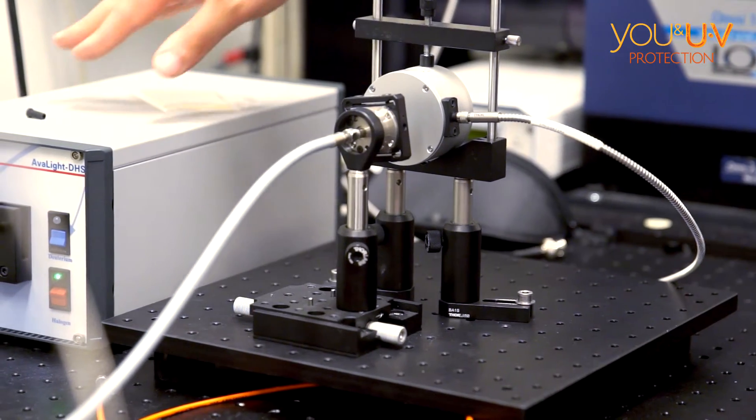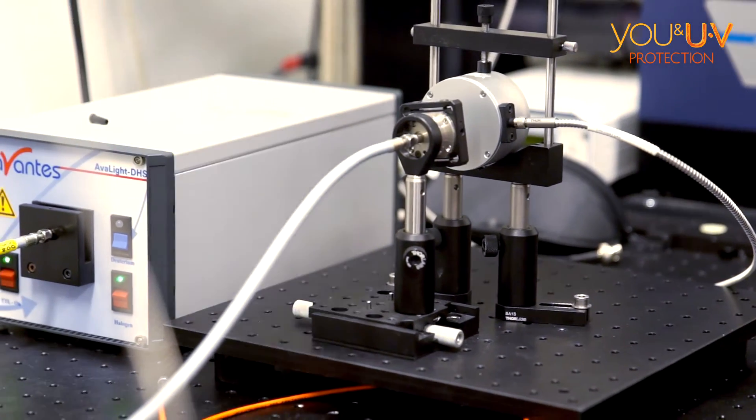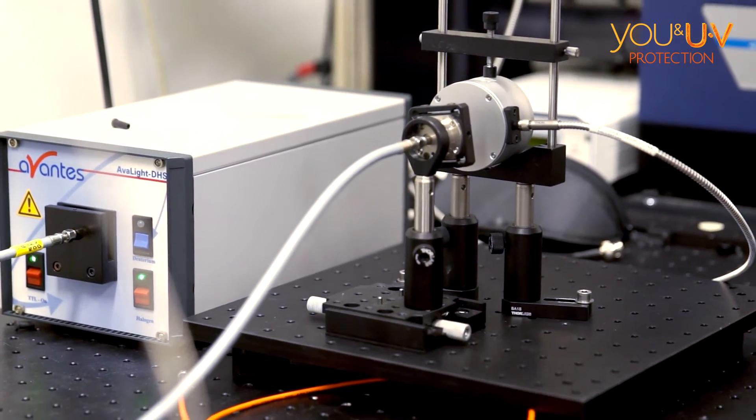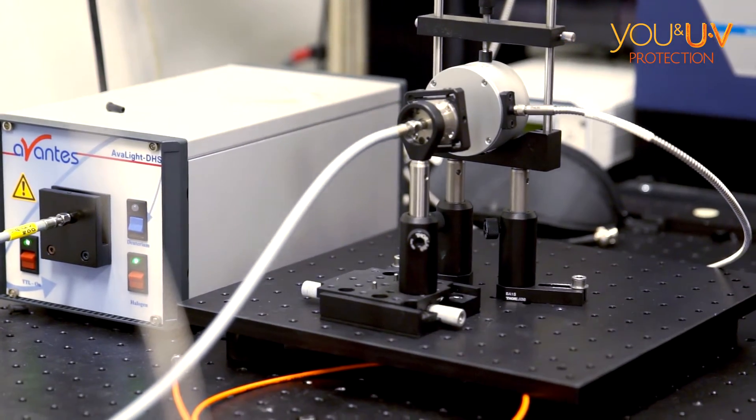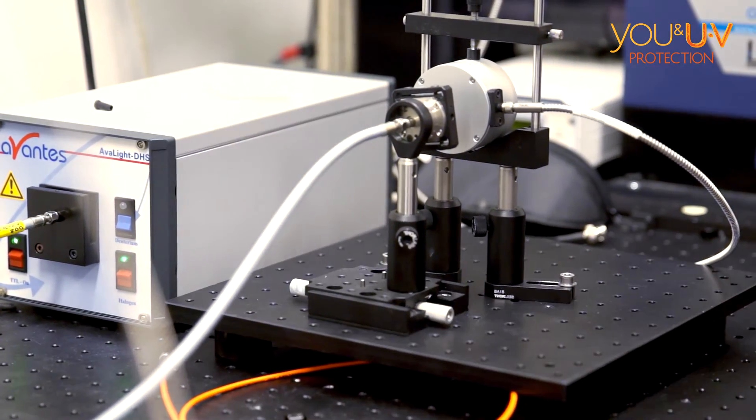We have here a light source, either halogen, which is a black body emitter, and that gives an emission spectrum which is mostly visible light, near infrared heat—a lot of heat and a lot of visible, very little UV.